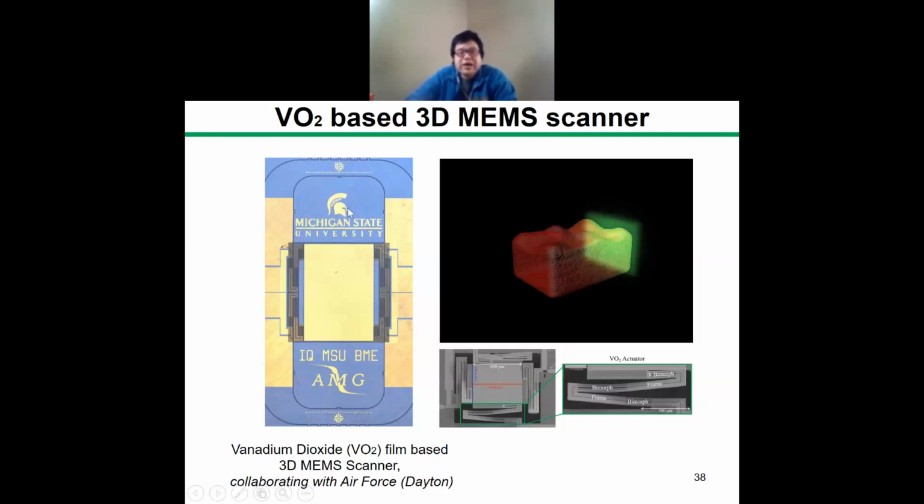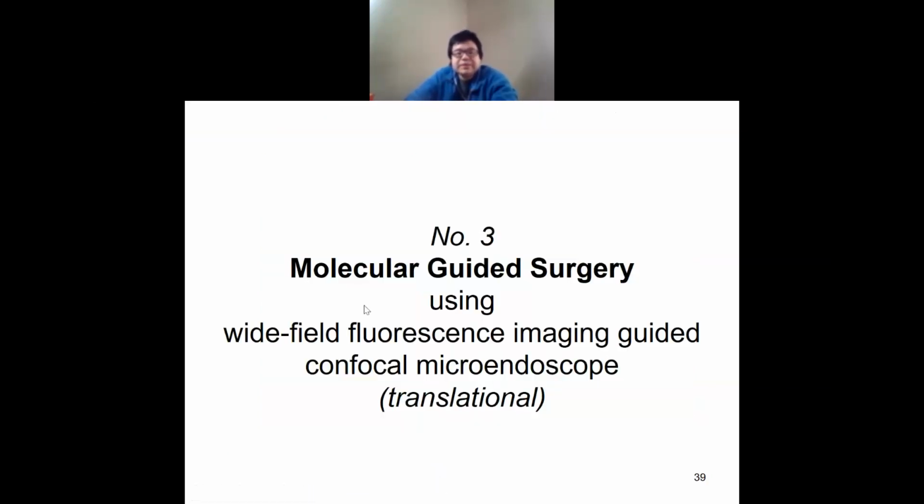And this is the area we'll also knock out. See the link arm here. The light will go through this hole. Eventually there will be a hole here. The fill factor is really high for this kind of device because you basically don't lose any area. This is the area for illumination, and this is the area for steering the beam, so it's smoothly, seamlessly integrated.